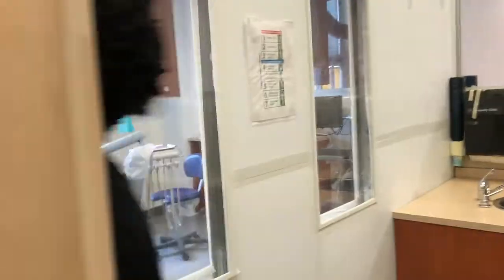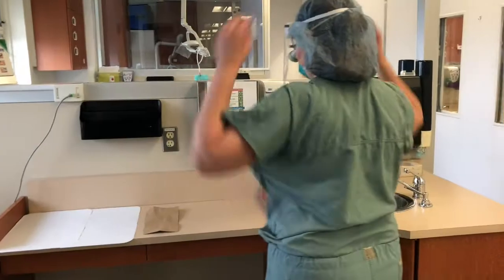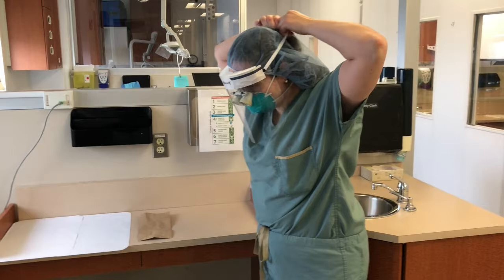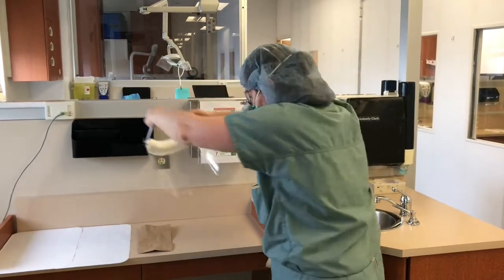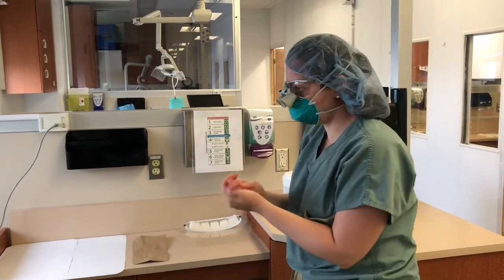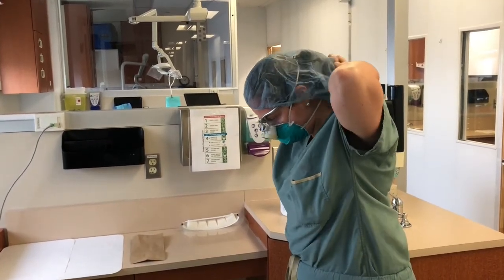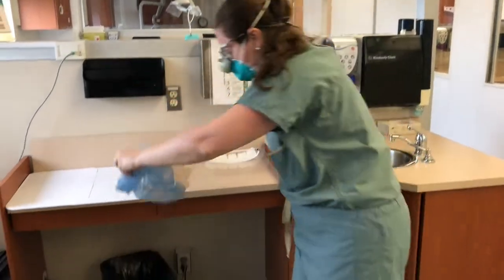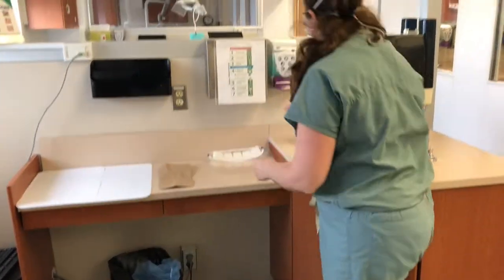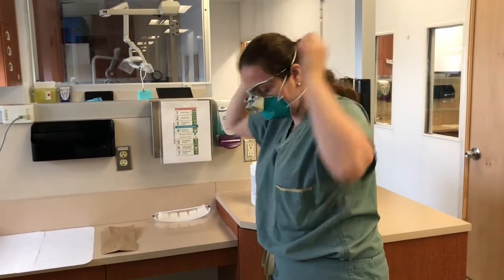Proceed to the doffing area. A poster indicating the appropriate doffing sequence is available for reference. Remove your PPE in the sequence indicated using hand sanitizer between each step. Remove reusable PPE onto the countertop.